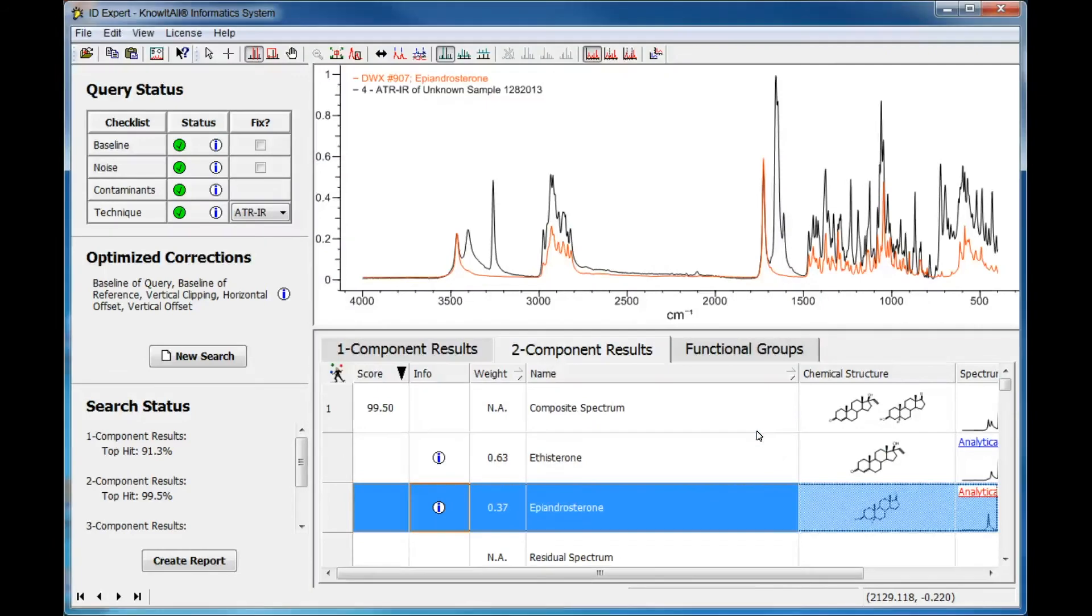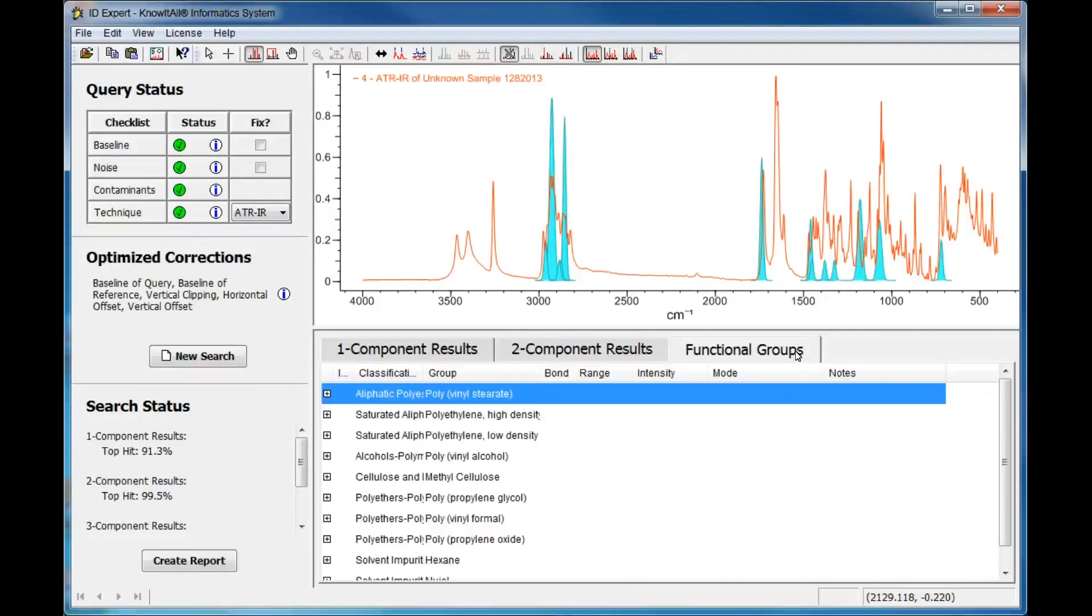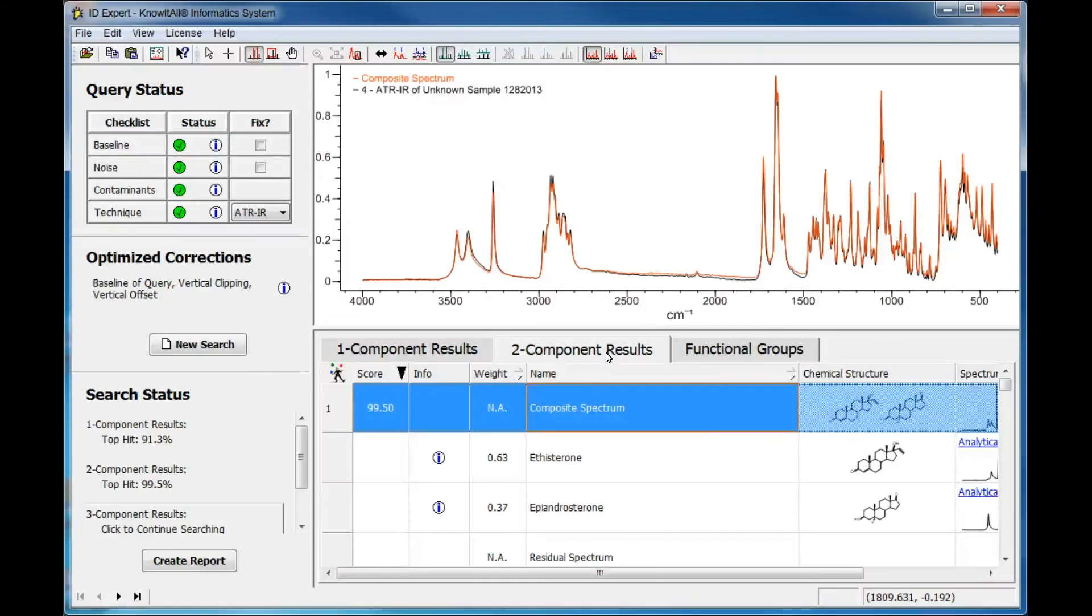Additionally, you can view the Functional Group Analysis tab results to verify or further classify your spectrum. Once you are satisfied with your results, you can create a PDF report.